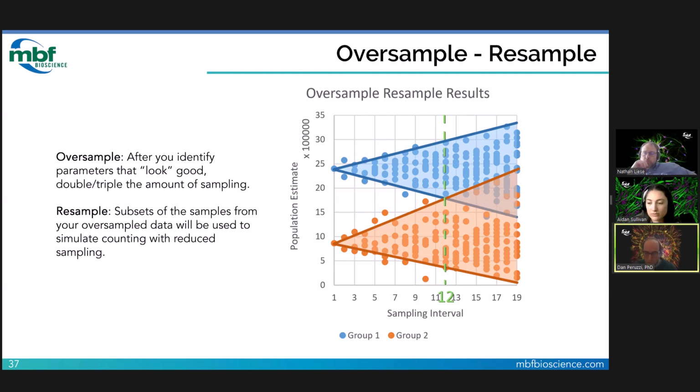We'll give you 2 graphs. And that would probably be okay, because a high estimate from the low mean group will not overlap with a low estimate from the high mean group. Yeah, so that one there is a high estimate from the low mean group, that orange one right there. And notice that's pretty far away from a low estimate from the high mean group. So that's why we want to be to the left of that sweet spot. So I think this would be a good thing to do with your data.